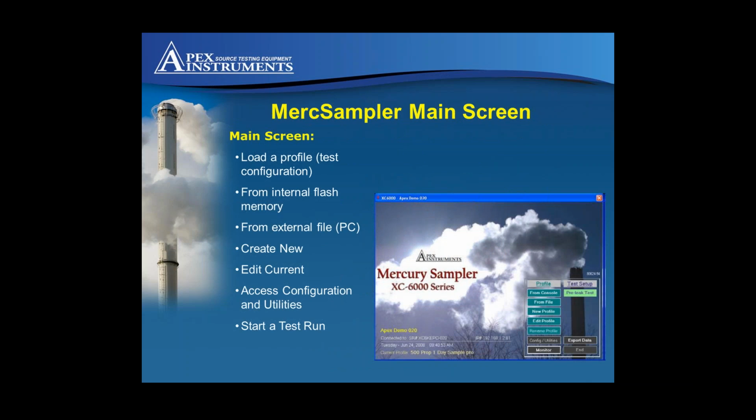Yeah, I'll just click through. Okay, so this is the main connection screen here, and when you click the little red icon to bring the software up, you're going to first have to connect to it, and that would be on the left-hand side down at the bottom, typically. And you just click connect, and it goes through a small process. It always remembers the last test that was being run, the profile that was being used. So you've always got one internally. We use a little standardization: you notice it's a fluorescent green. That's the indication of what's next to come.